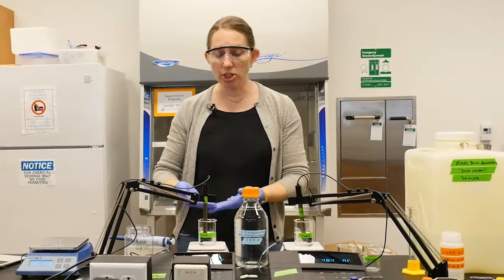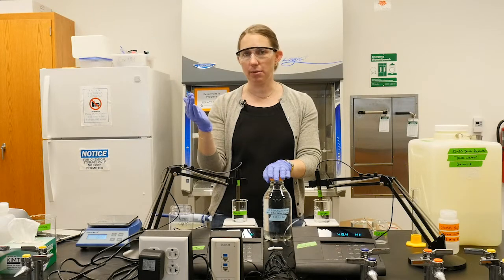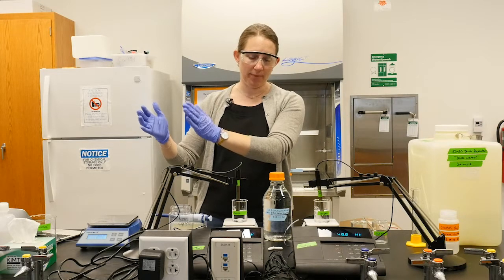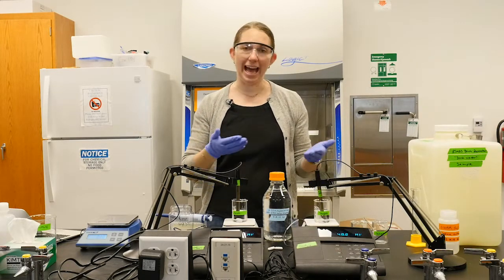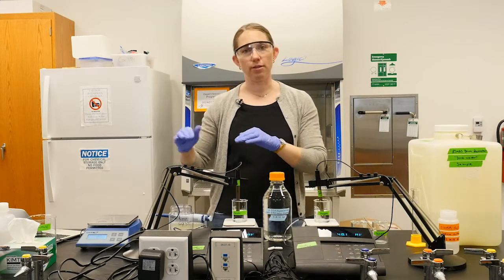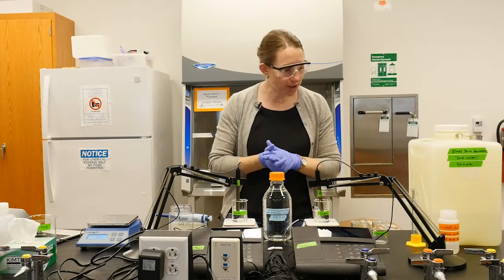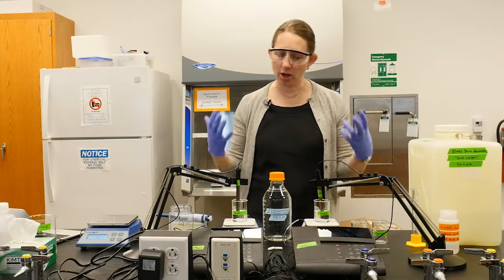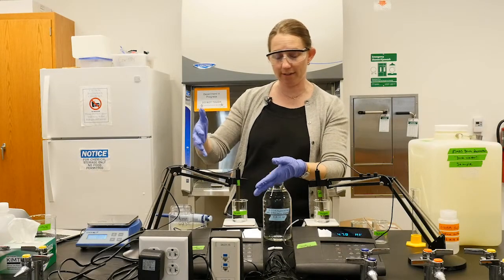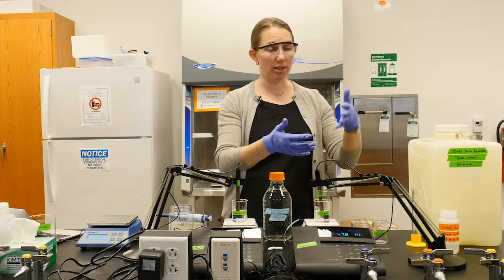And what we're doing is we're going to be adding acid to seawater samples, and that's going to be changing the acidity of the seawater and shifting all of those species over to carbonic acid. So the way we quantify these is by measuring how much acid we have to add to our seawater sample to get all of the dissolved carbon into the carbonic acid form. So functionally today we're going to be doing a titration, and as always, to understand something in our unknown or in our sample, which is what we have set up over here, we have to compare that to a known sample. So this is our standard over here.